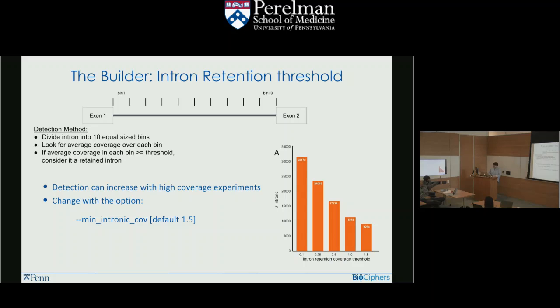I would just point out that this is currently what's implemented. We don't think this is ideal. We have ideas to improve it, and hopefully some of those things will be adjusted automatically with a better algorithm. But right now, it really depends. For example, if you're looking for changes in the protein, you really want to capture those. Maybe these are splicing noise or irrelevant variants that are degraded, and you don't want them to clutter your visualization in VOILA, then you increase it, right?